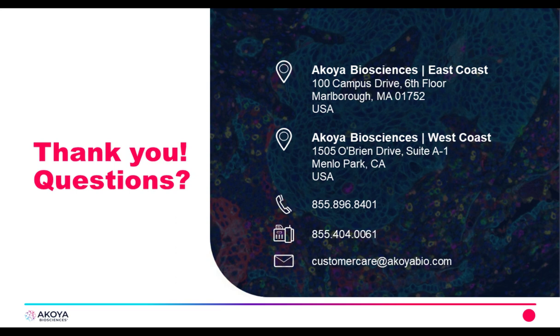Okay. Thank you. And this is for Dr. Saunders. What was your evaluation of the efficiency of CODEX's cell segmentation pipeline? Did you try an alternative method such as CellProfiler?